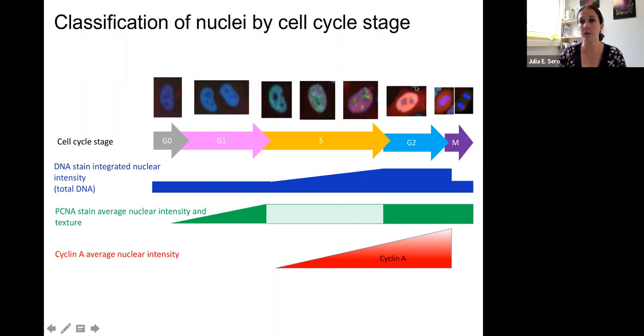And when we get to cells which are in G2, they are blue and green and red, but not spotty. And then we've got cells, I don't know if you can see this, which are in mitosis, either in an early stage before the DNA has gone from the center of the cell into 2 daughters, or at a later stage of mitosis.